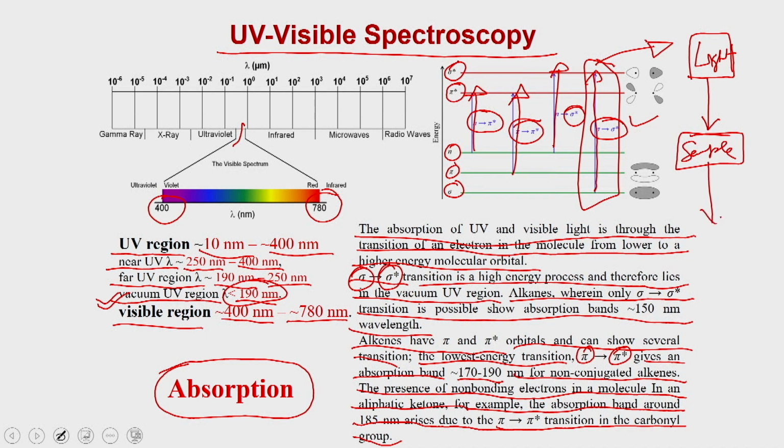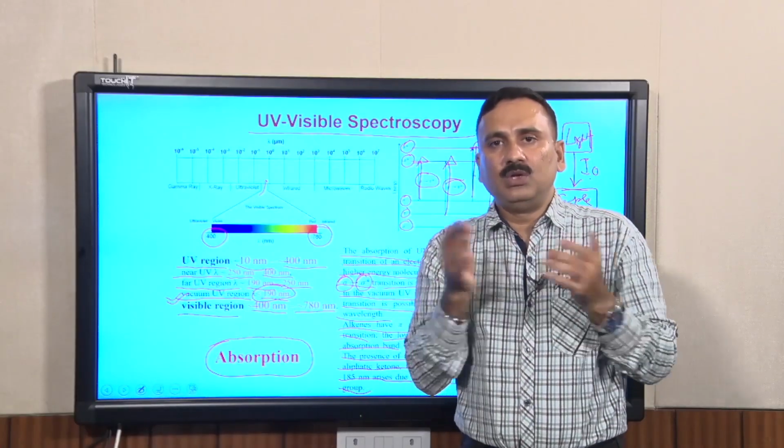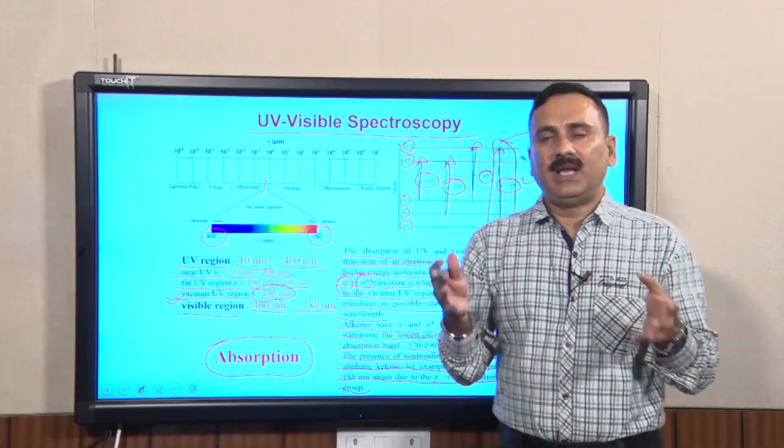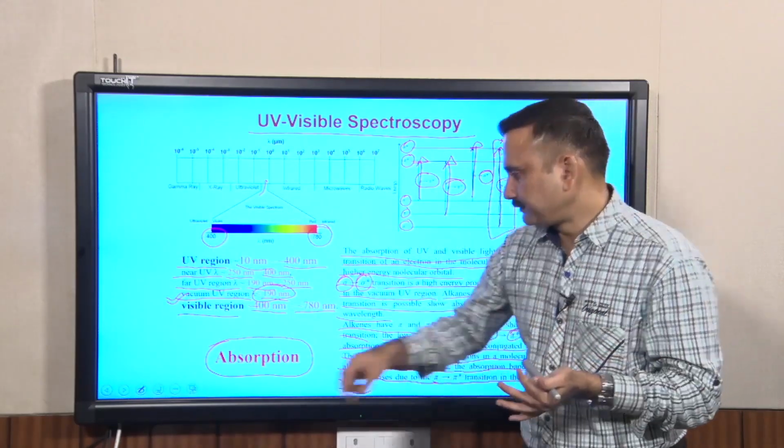Then you need something that will tell you how much is the absorption. Suppose I am providing I0 as the initial light and I get the I light; it should tell me how much lower I is than I0, and that is going to be used to calculate the absorption of the light by this particular molecule.